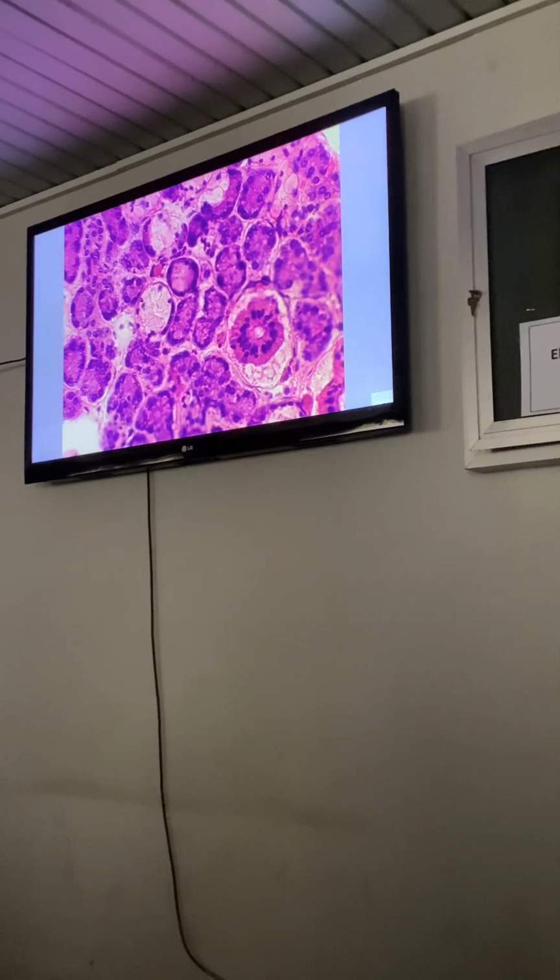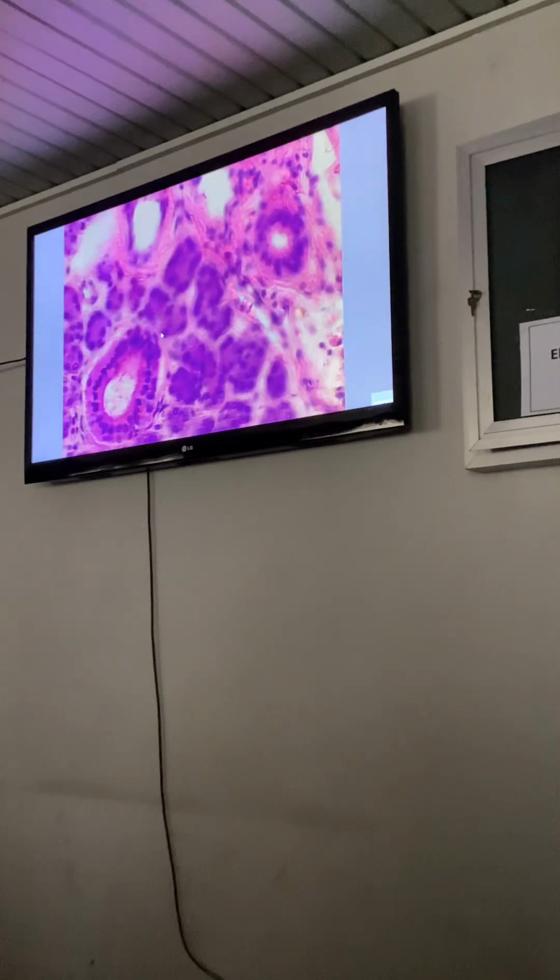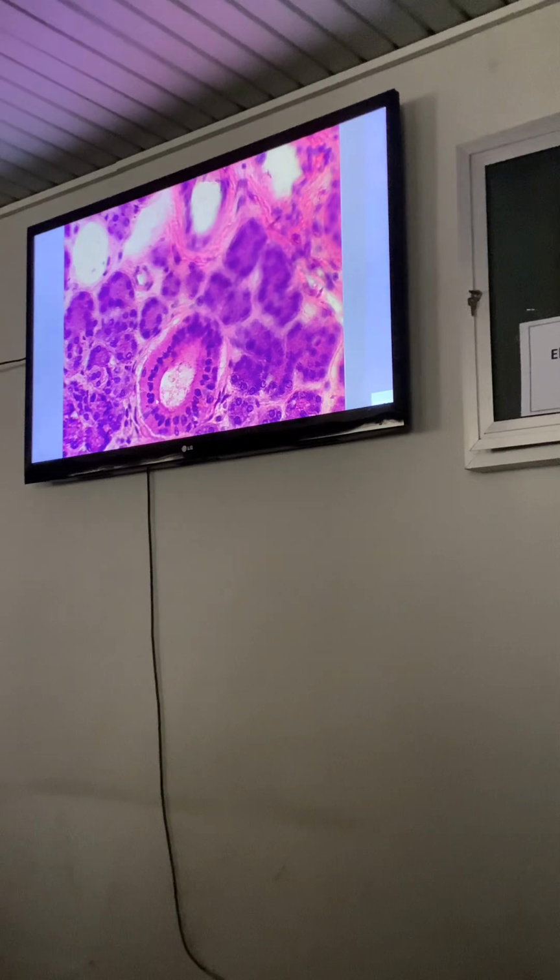This structure is called serous or mucus? Serous. And this structure, mucus. Which type of duct? Which type of duct?